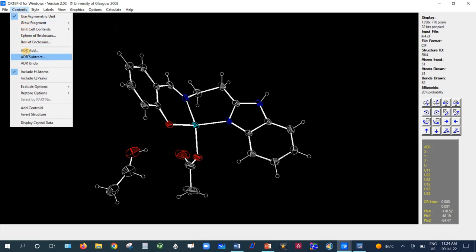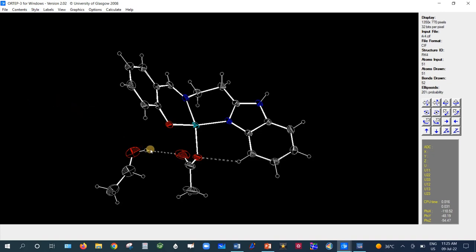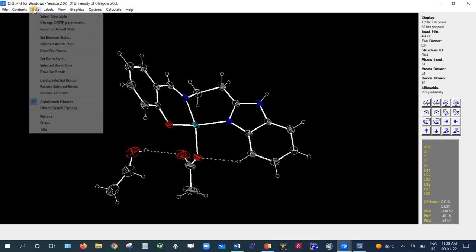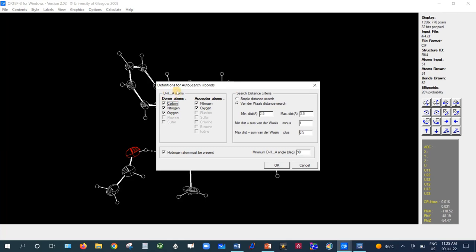Under Style, there is an H-Bond Search option for automatic hydrogen bond searching. Pressing this button will automatically find hydrogen bonds — for example, between the hydrogen of the ethanol and the oxygen of the acetate. In the manual H-Bond Search option, you can specify donor and acceptor hydrogen atoms, set the minimum distance (2.5 Å), maximum distance (3.5 Å), and minimum angle to define the hydrogen bond criteria.